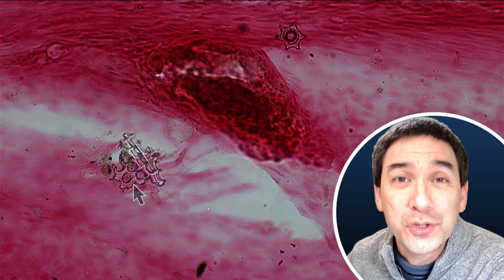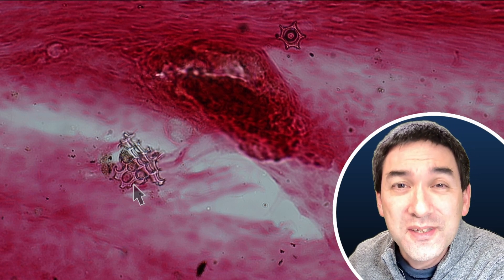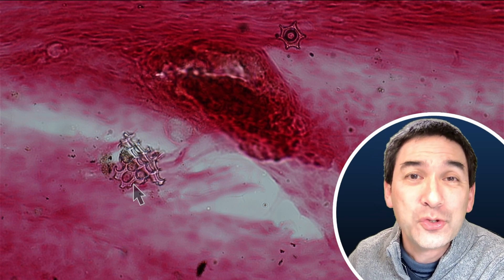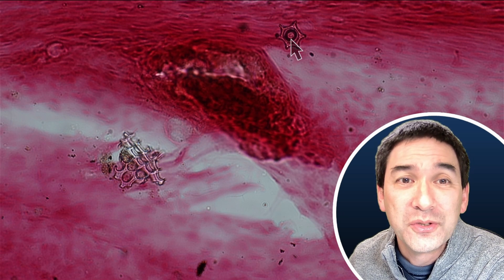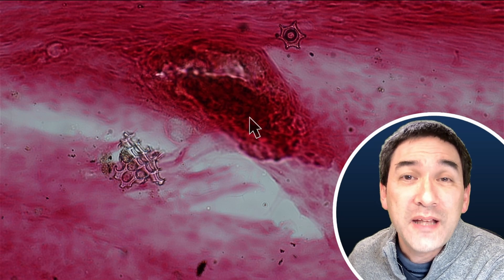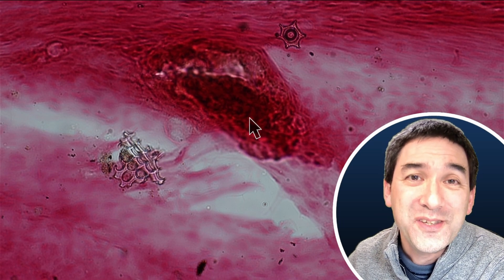So if you use a tiny little brush, for example, for positioning this specimen, and if they used the same brush for manipulating those radiolarians, then it's quite easily possible that there are some cross-contaminations. And there's also one over here — so as a matter of fact, on this slide I found several instances of these radiolarian shells.